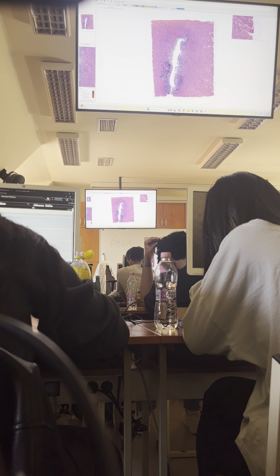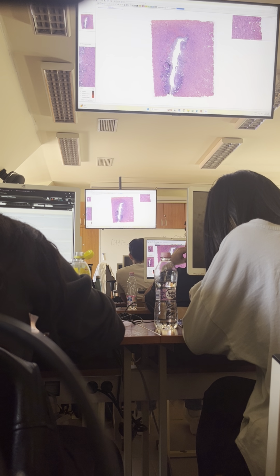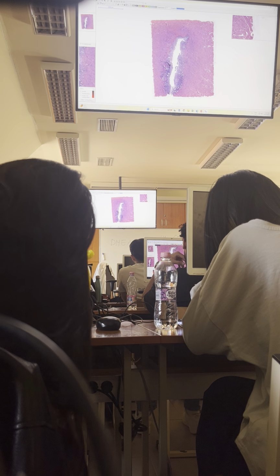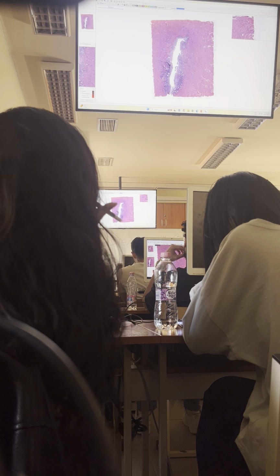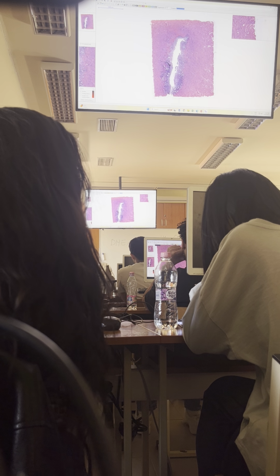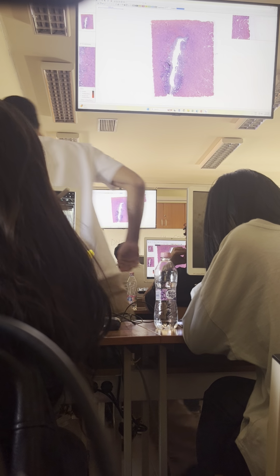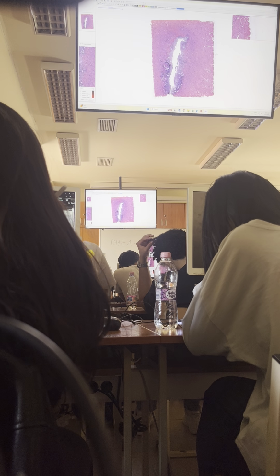But as you can see, there are artificially cut edges everywhere, because they are very regular. Unfortunately, the assistant who did this in the past believed that the rest is not important, so she just dropped it away. So we cannot see the entire myometrium. The outermost layer is missing, and also missing is the so-called perimetrium.